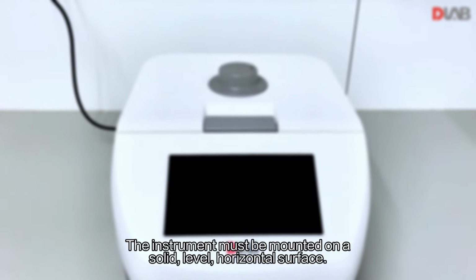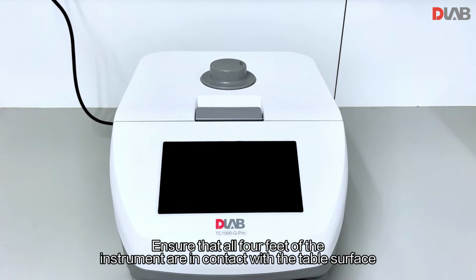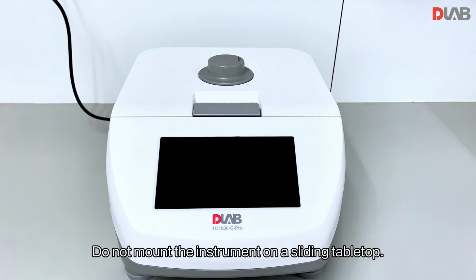The instrument must be mounted on a solid, level, horizontal surface. Ensure that all 4 feet of the instrument are in contact with the table surface. Do not mount the instrument on a sliding tabletop.